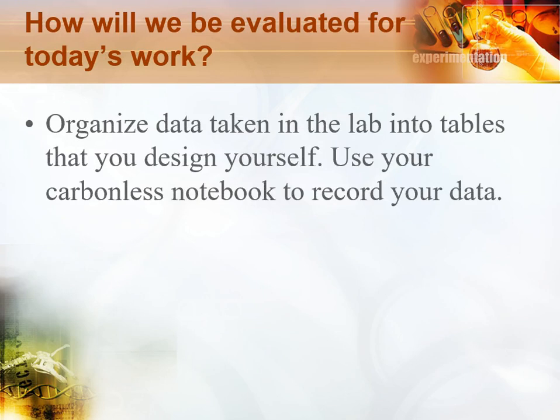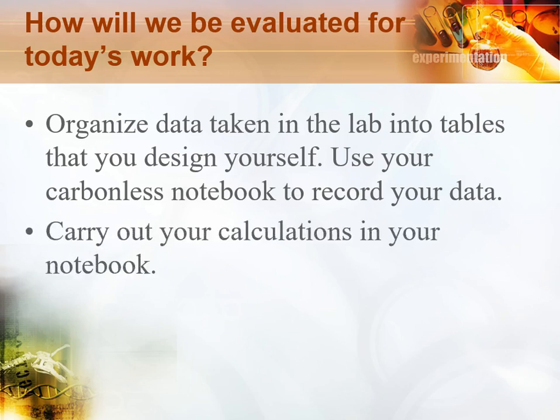So the evaluation for today's work is that in the first 2 experiments we designed tables for you, but what you will want to do in your carbonless notebooks is organize the data taken in the lab into tables that you design yourself. And you want to record your data as you go along doing this experiment. And then you will also want to carry out your calculations in your notebook.